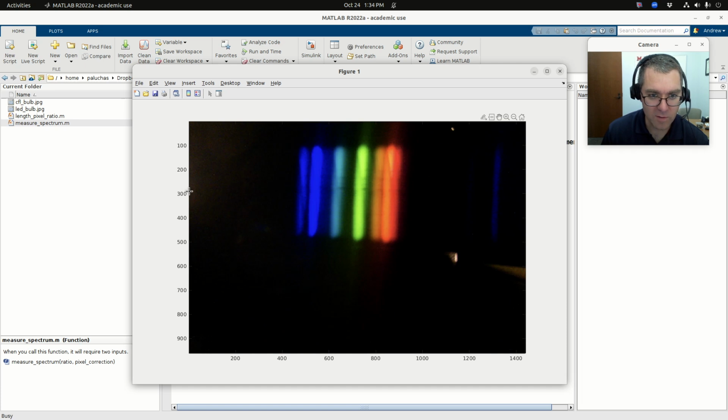If I click once, I've got my line forming. I'm going to bring this all the way across to the right edge of my image, and I want to keep this as horizontal as possible. Once I'm satisfied with my placement, I'm going to double click.